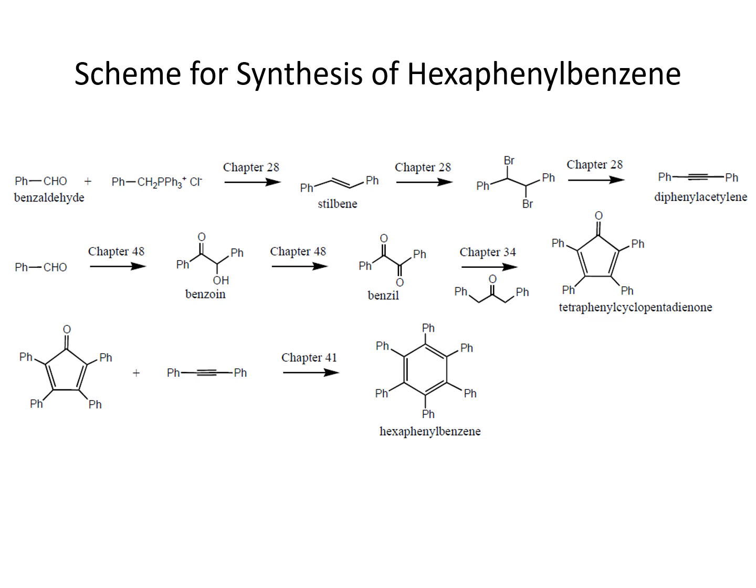With that, we finished the first pass, and the second pass, which leads us to the second major reagent for the synthesis of hexaphenylbenzene, is the one that we will be starting today. The first step in the second pass is to synthesize benzoin from benzaldehyde, and that is what this lab lecture will focus on.